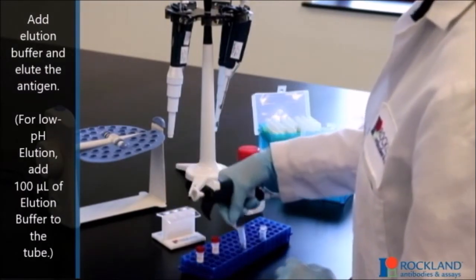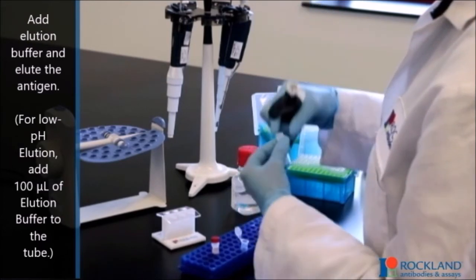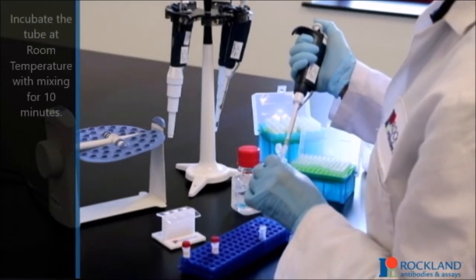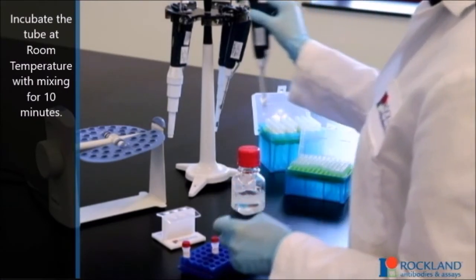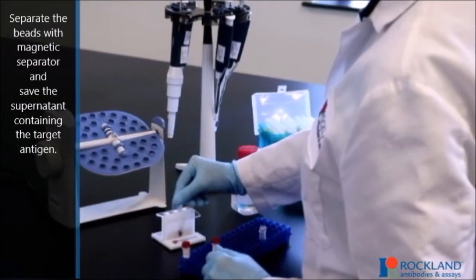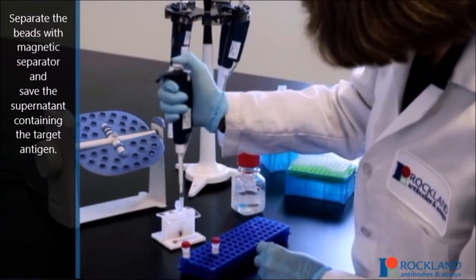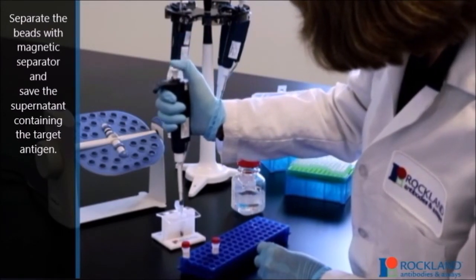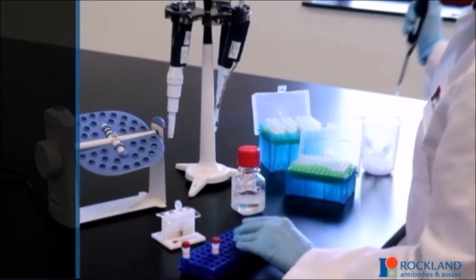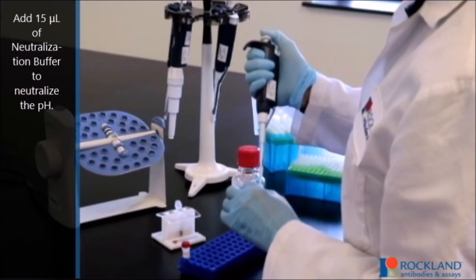For low pH elution, add 100 microliters of elution buffer to the tube. Incubate the tube at room temperature with mixing for 10 minutes. Separate the beads with a magnetic separator and save the supernatant containing the target antigen. Add 15 microliters of neutralization buffer to neutralize the pH.